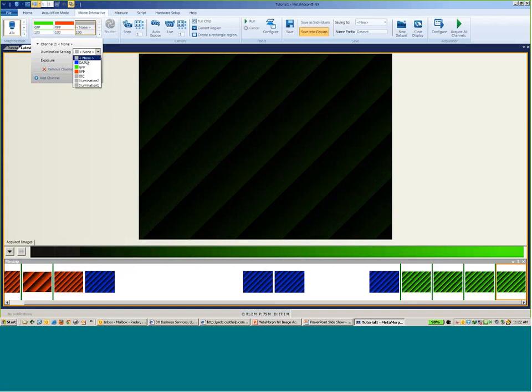So your Z-series acquisition, as I mentioned before, is a range around current. So it's doing a range of 10, 2 microns each step. So we're looking at 5 acquisitions, half above, half below, at 2 micron steps. Then we would set the time series. So the interval is how often, the duration is how long. So we're acquiring 1 a second for 5 seconds is the acquisition sequence that we're doing.